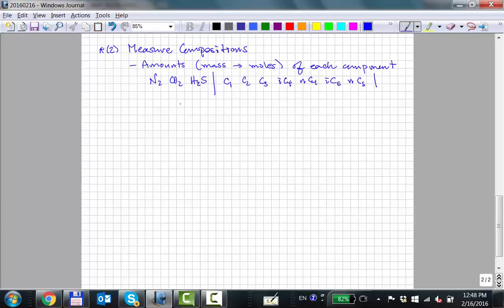And then you get a bunch of hydrocarbon isomers until we get out to about C11, and then they quit trying to identify which isomers are in C11. They get tired, or there's too many of them. So they give up. These isomers are between C6 and C10 typically, maybe C9.